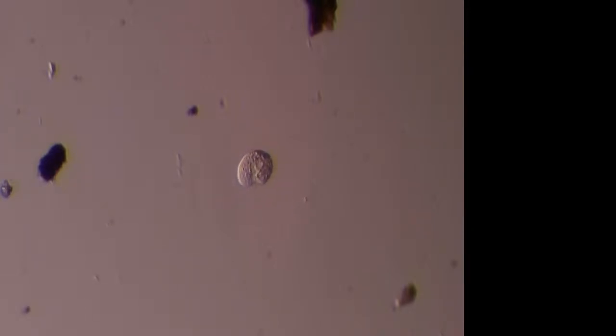Critters in the background. That's fun. Okay, looks like I calmed down. Oh, now it was on the move again. Alright. There's a German term biologists use for when the urge to migrate hits the birds and they take off: Zugunruhe! That's what this guy's doing. It's like, I gotta get out of here. Zugunruhe. Alright, come on.